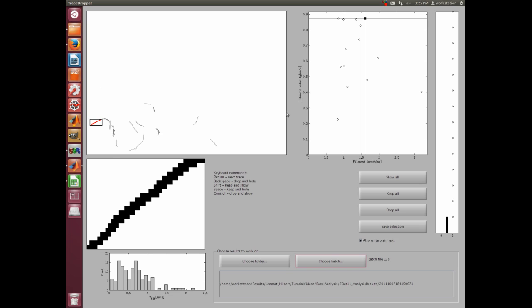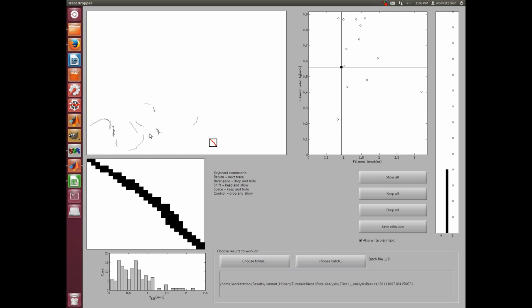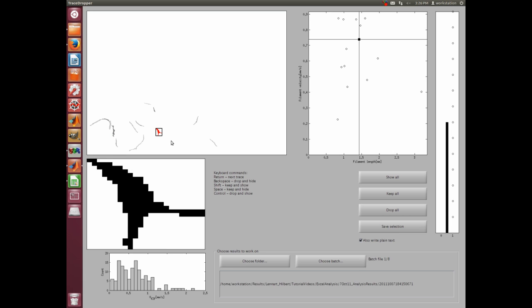And this here is your main working surface, where you can go and select different traces. So a trace like here, for example, this one looks pretty okay. You can see other traces of filaments like here. They have all sorts of things coming out at the sides. They don't look smooth, so this one would be rather suspicious. So the task now is to basically go through all the images of filaments here and reject the ones that are not up to our standards. So like this one or this one here.